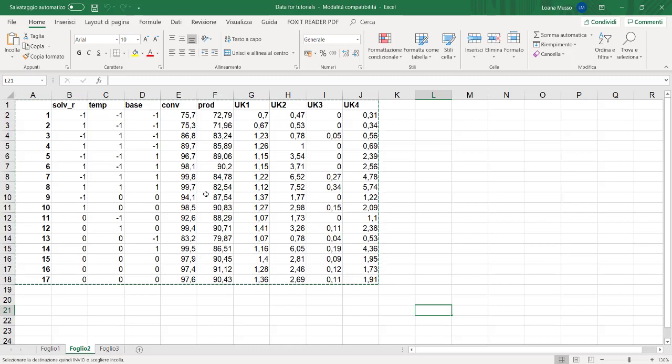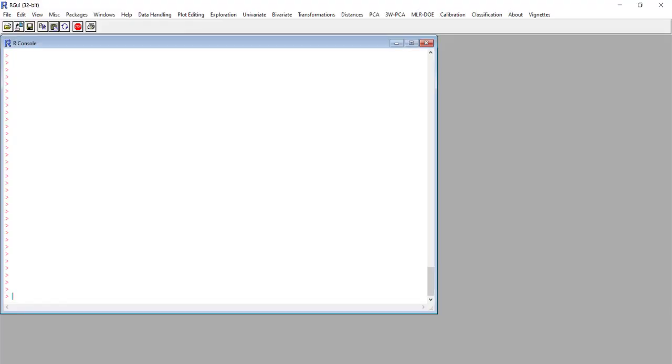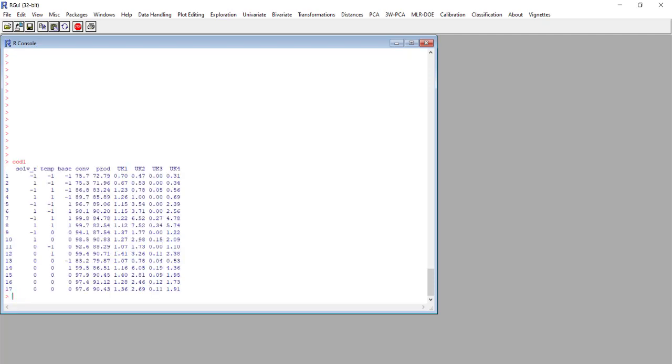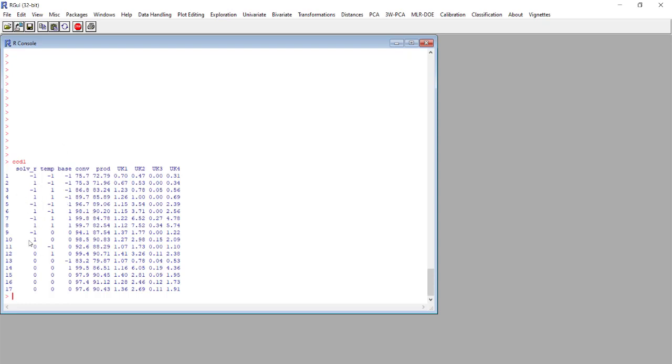We imported this matrix to CAT and the matrix is called CCD1 and we can see here the full matrix. So the first column is the names, the tags of the rows. We see the names columns of the columns and here we see all the columns of the responses and the variables.